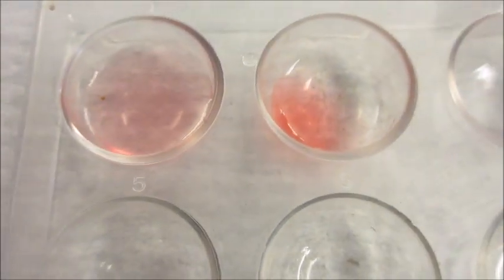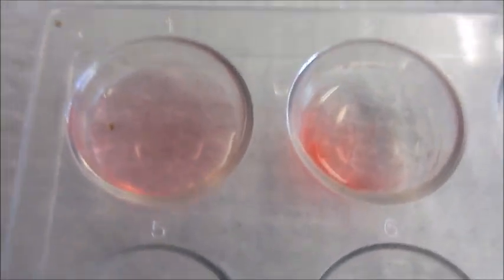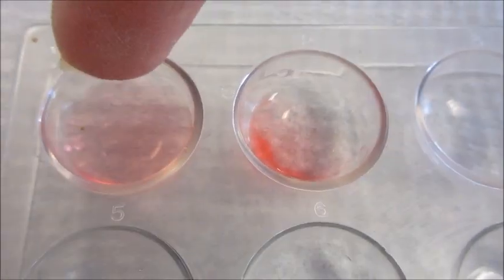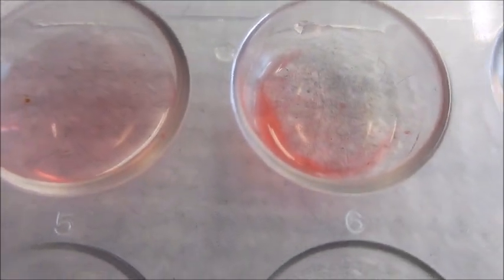If you look closely, the Sudan 4 diluted into the water. But with the fat, it created little particles and it was a little darker too.